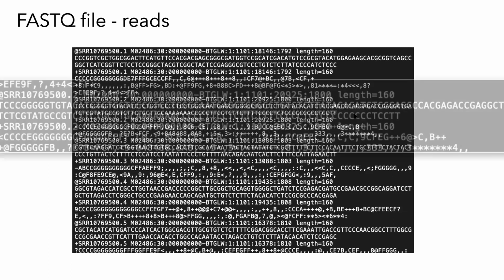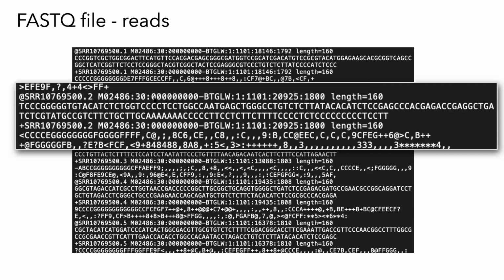So let's take a look a little bit closer. Here we have the length is 160. We have the actual read sequence, right? And we also have the quality. So here you have the read, here you have the quality of each position.